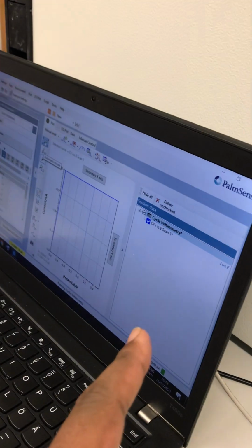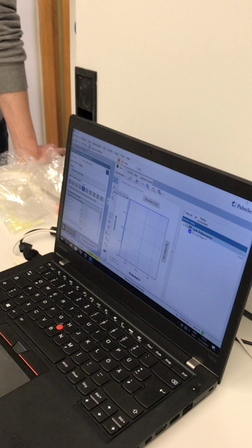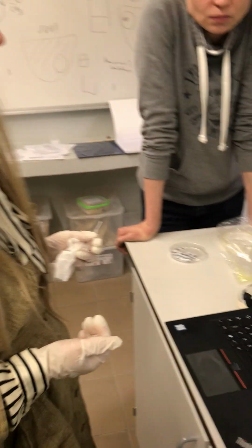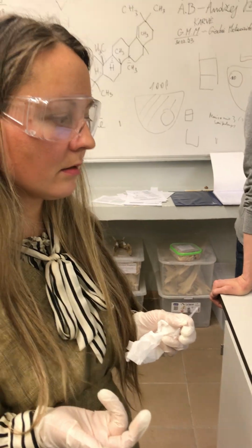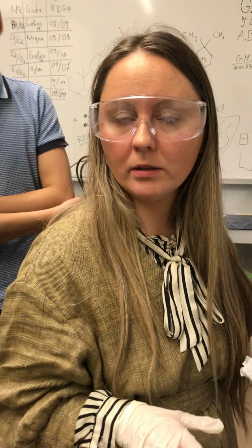I see. Are they CSV files, or can you download the raw data in some format? You could have a text file, you can have a CSV file. Also, there's another kind of file I can share with you, the original one, saved by the software. I was able to open those using Python code, and I could share the code as well.